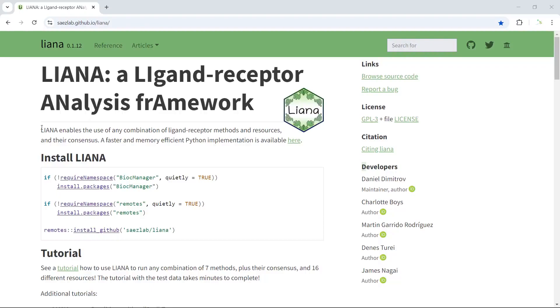The LIANA package has a collection of cell-cell communication analysis methods. It has a wrap function to use any combination of ligand receptor method and resource. If you haven't installed the package, you can use the guidance provided to install it.